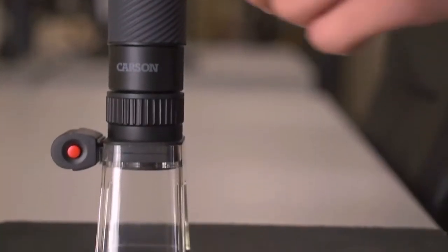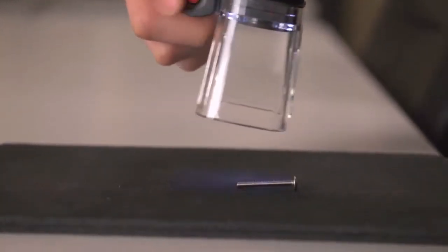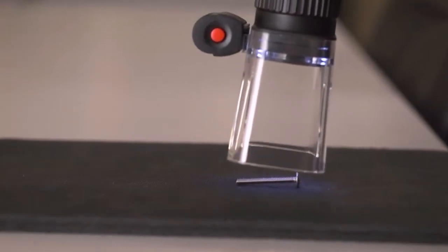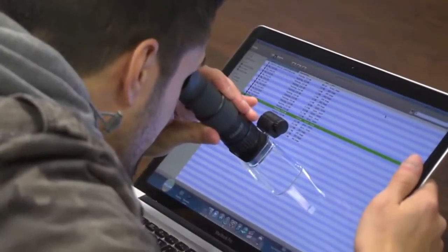When using the microscope feature on things like 3D objects I was really impressed with how sharp of an image you can actually get. The fact that you can manually focus really let you inspect 3D objects easily. Put the microscope over anything you're guaranteed to get some interesting results.